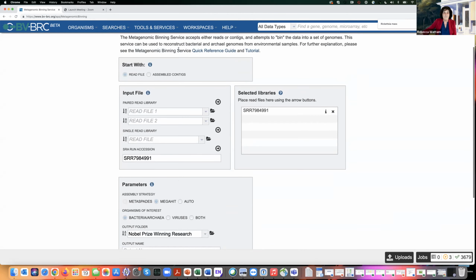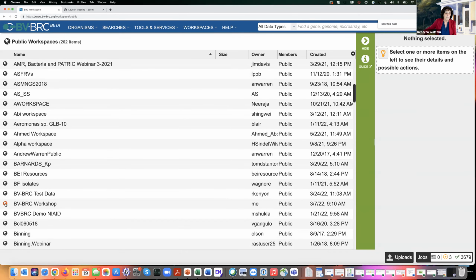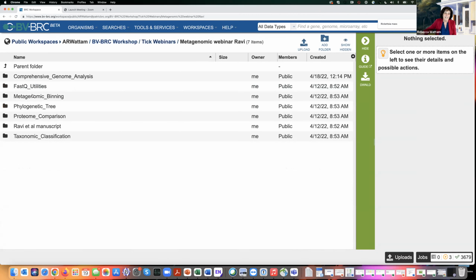But like everything else that I've told you, I've already prepared this. So let's go into public workspaces. And let's scroll down to BV-BRC workshop, and the tick webinars, and then the metagenomic webinar. I know, lots of clicking. And then this one is metagenomic binning.